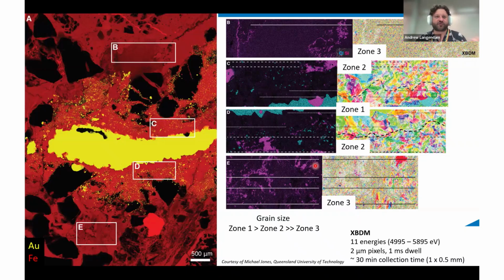So it's very much like you've crushed up the rock and then looked at it. But here we don't want to crush up the rock because it's on a thin section already, and that's useful for other things. So this is an effect that is evident with a lot of very strongly oriented minerals, and has different effects with different elements, depending on what their spectral characteristics are.